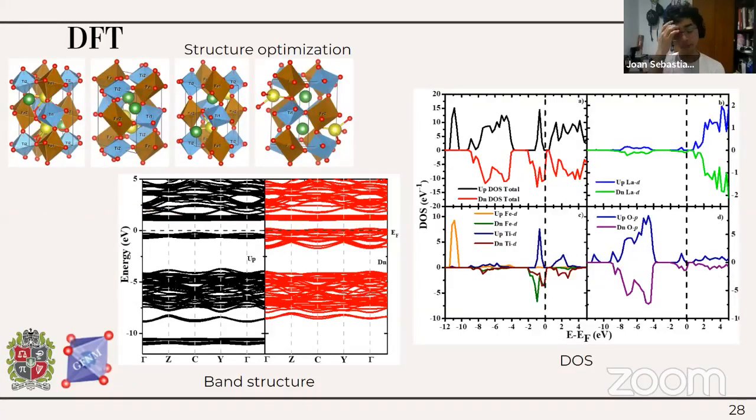Digamos que para hacer el refinamiento Rietveld primero necesitamos el modelo, y el modelo lo obtuvimos por un software que se llama SPuDS, que es básicamente un software que, a partir de cálculos geométricos, permite simular posibles estructuras que pueda tener, en particular, compuestos de tipo perovskita. Entonces comparamos diferentes tipos de modelos que daba el software. Miramos también ordenamientos de perovskita simple sustituida o de perovskita doble con ordenamiento de tipo sal. Y la que más me gustaba fue la monoclínica del grupo 14 que mencionaba el profesor hace un ratico.